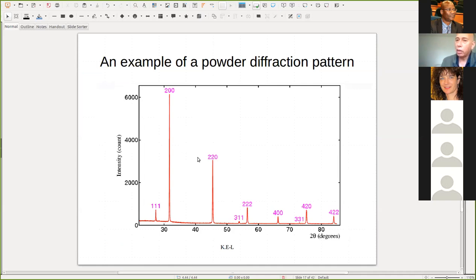So now you go into the lab, you send your X-ray beam at your sample, and you rotate your crystal around, and you're going to measure some peaks. And then now you know how to figure out other absences, or you can see the intensities are different. So if I took these intensities, I could probably reconstruct what the structure looks like. And for a simple thing, of course it's easy, but for most things you need hundreds of peaks to really get a good structure.